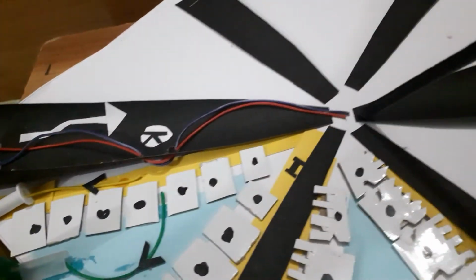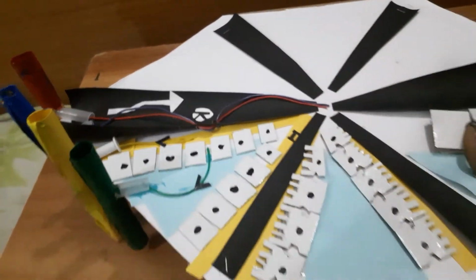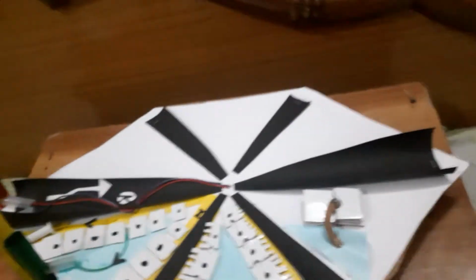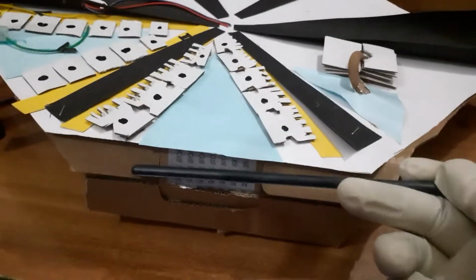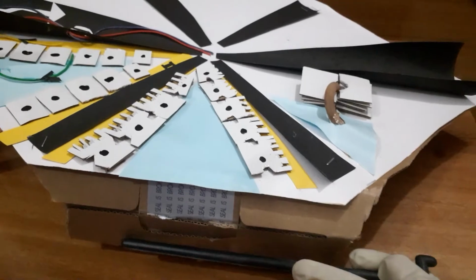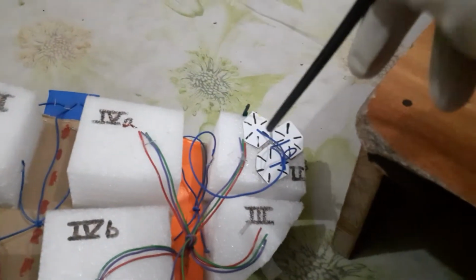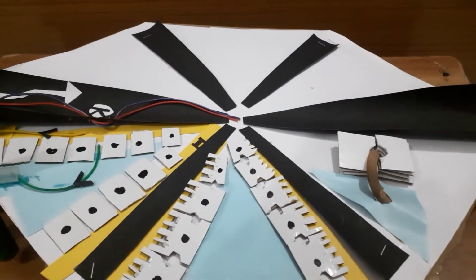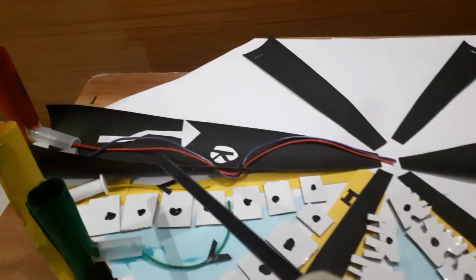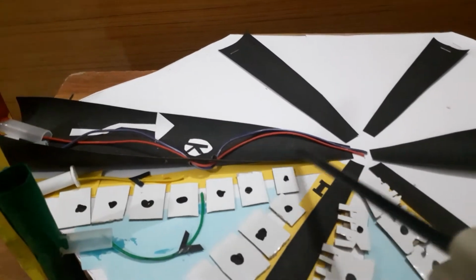Okay. Now blood is coming to the central vein from all sides. Okay, the hepatic lobule is hexagon in shape, and many hepatic lobules are arranged like this in this slide. This is one hepatic lobule which I have in last form. It is here. Okay, and the flow of blood is towards the center, so centripetal arrangement.